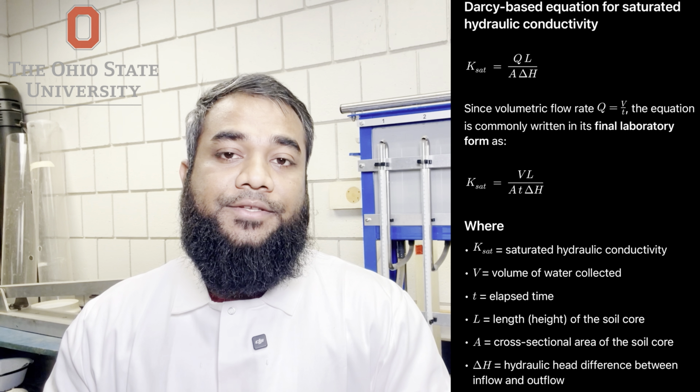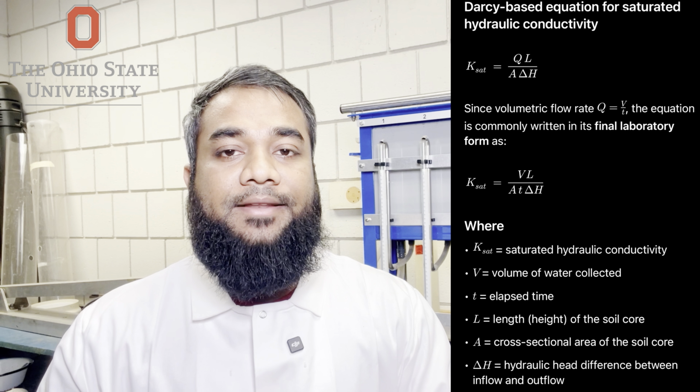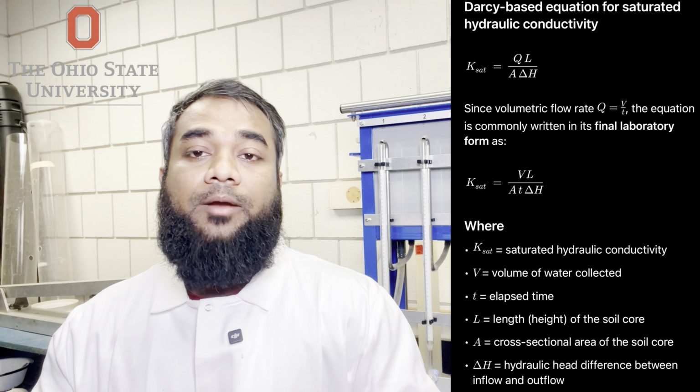Ks, or saturated hydraulic conductivity, is commonly reported in centimeter per second, centimeter per hour, or millimeter per hour. Consistent units are essential for comparison across treatments and studies.